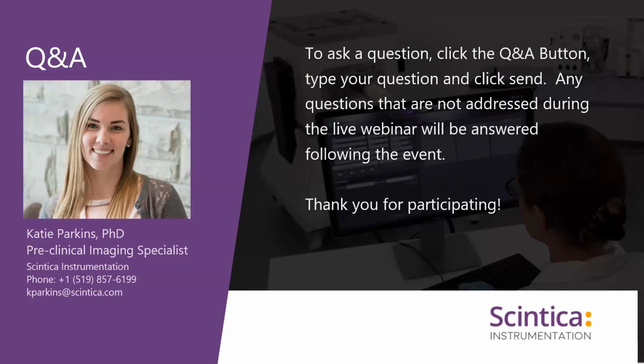But if you are imaging brain, or let's say lungs, then the incision would be really damaging to the animal. In those cases, if you can work around it, it's fine. But I think it would be difficult to do longitudinal imaging. So it depends upon your tissue. The instrument has the capability of longitudinal imaging.